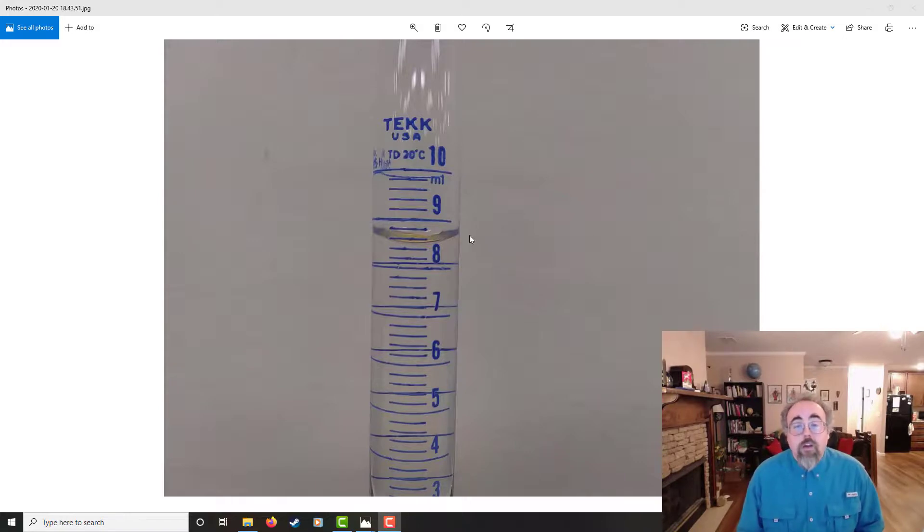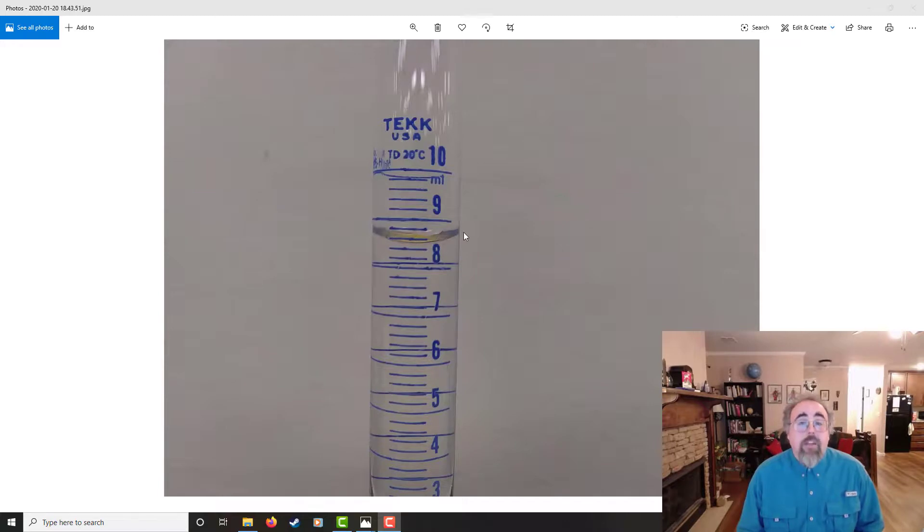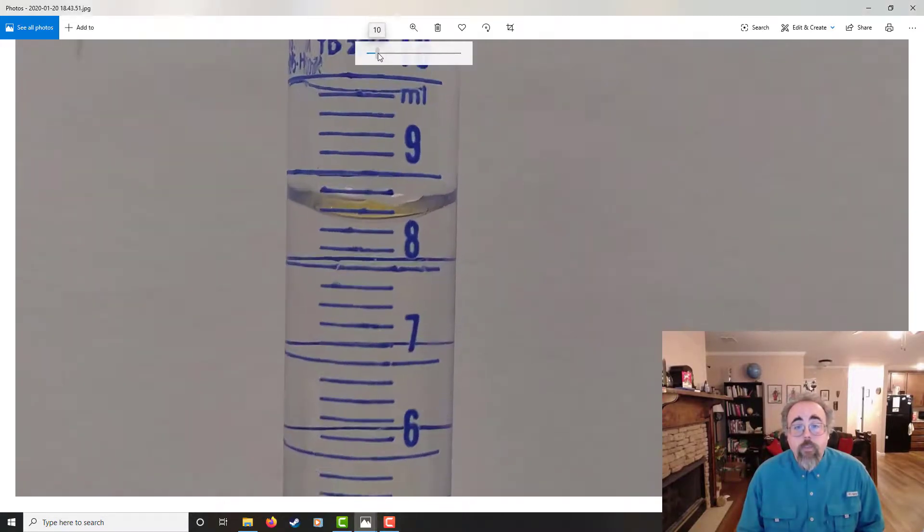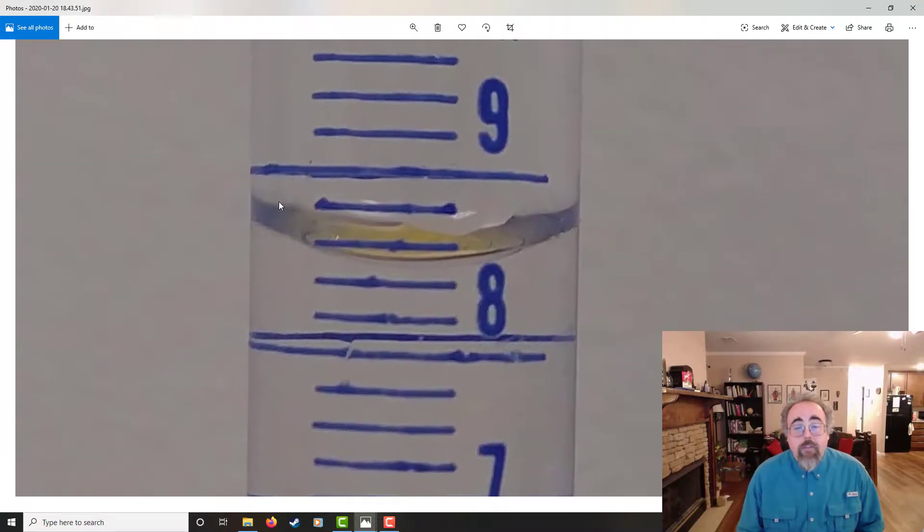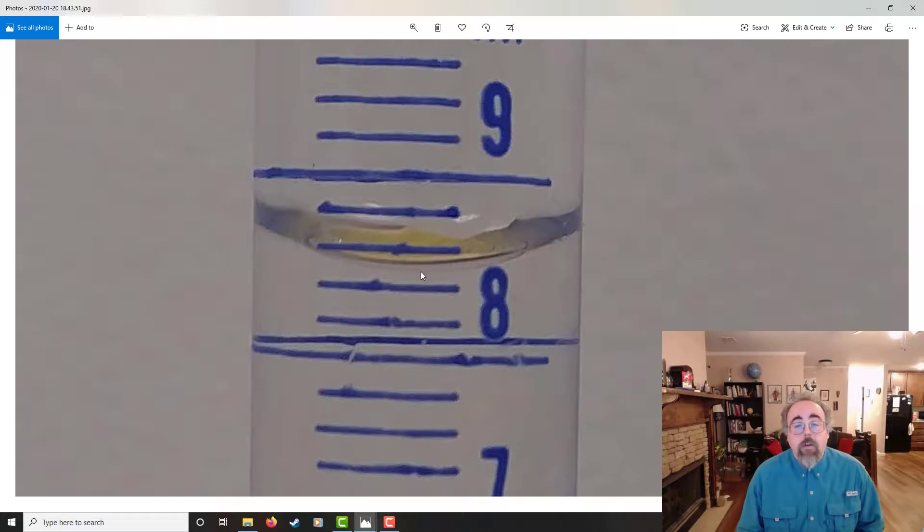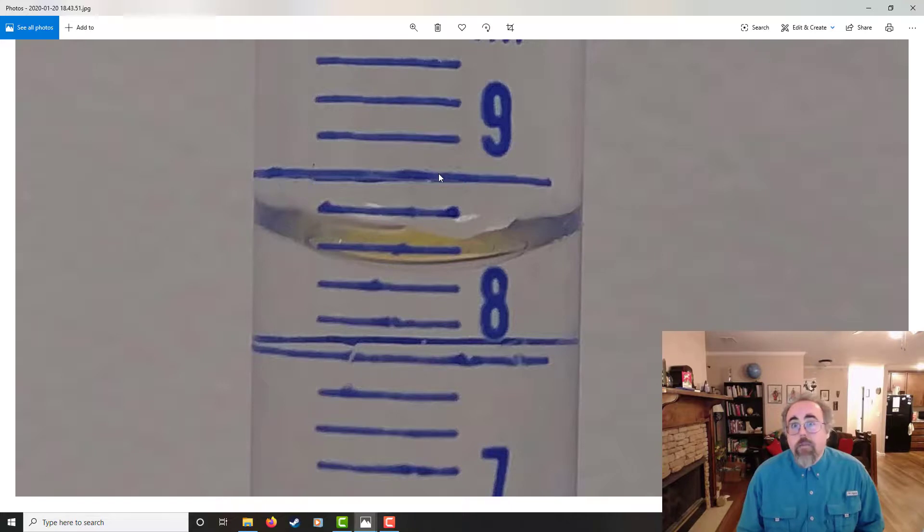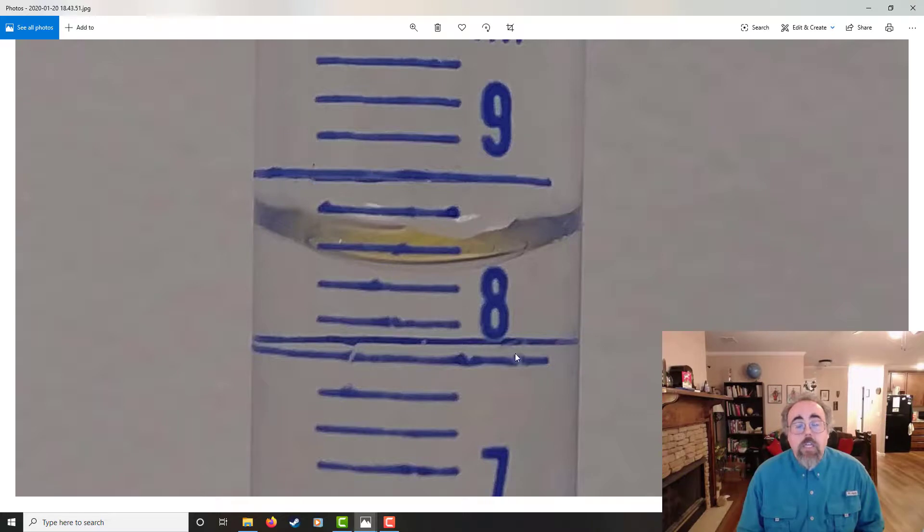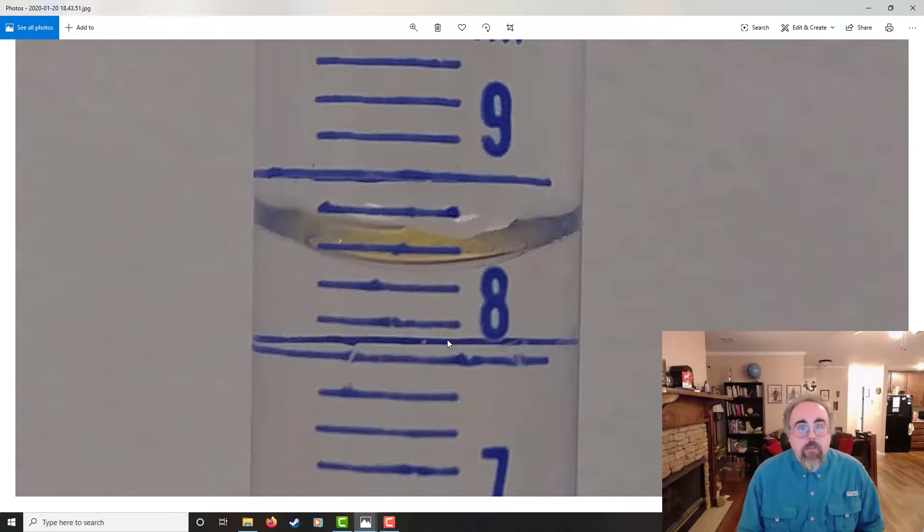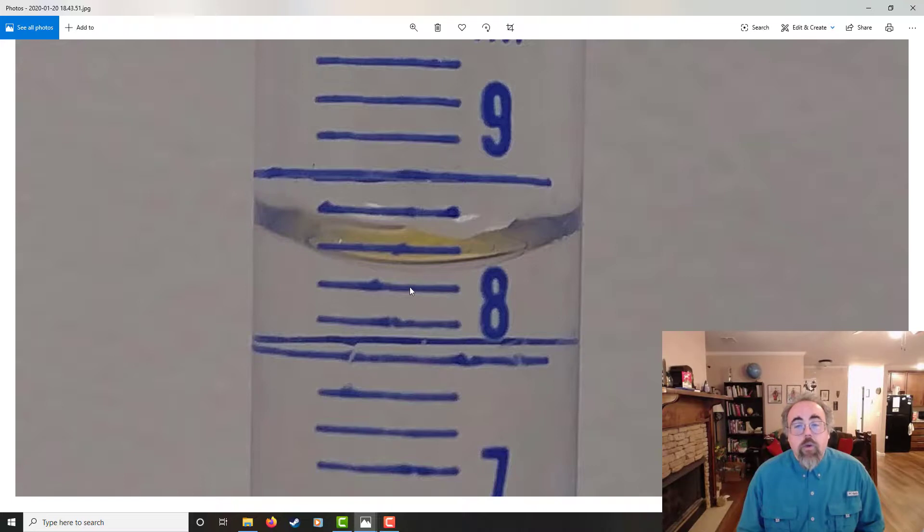Okay, so I'm looking at this one. First thing also, I notice it's glass, so it's got a meniscus. Actually, it's got a pretty dramatic meniscus. The smaller the graduated cylinder, the tighter the internal diameter ID is, the more dramatic your meniscus is going to be. Now, if I zoom in, once again, it's a dramatic meniscus. Really important that I read from the bottom of this one, and the bottom is probably going all the way down to there. Other thing I notice, one, two, three, four, five. There's only five tick marks here. That means each one's every two, so that's 8.2. There's the eight. Actually, I think that's the eight. That's the back end, the reflection from behind. The camera's a little high on that eight. That's one of the downsides, going all the way around. You can see both ends, but if you just kind of move your head a little bit, you see which one's which. Anyway, so that's the eight. That's the 8.2, 8.4, 8.6, 8.8, 9.